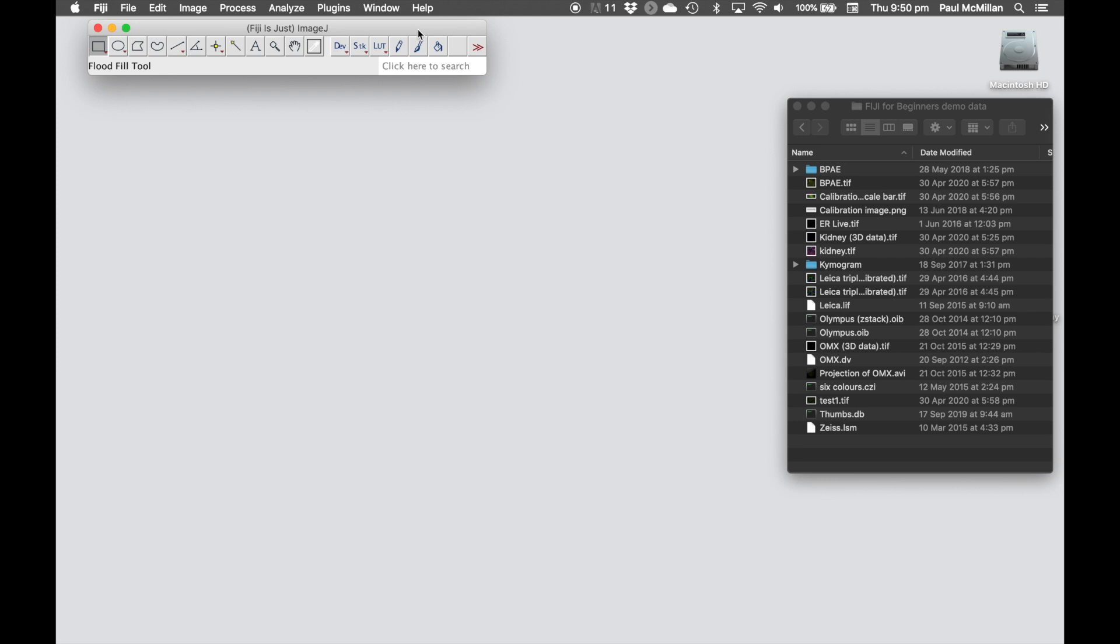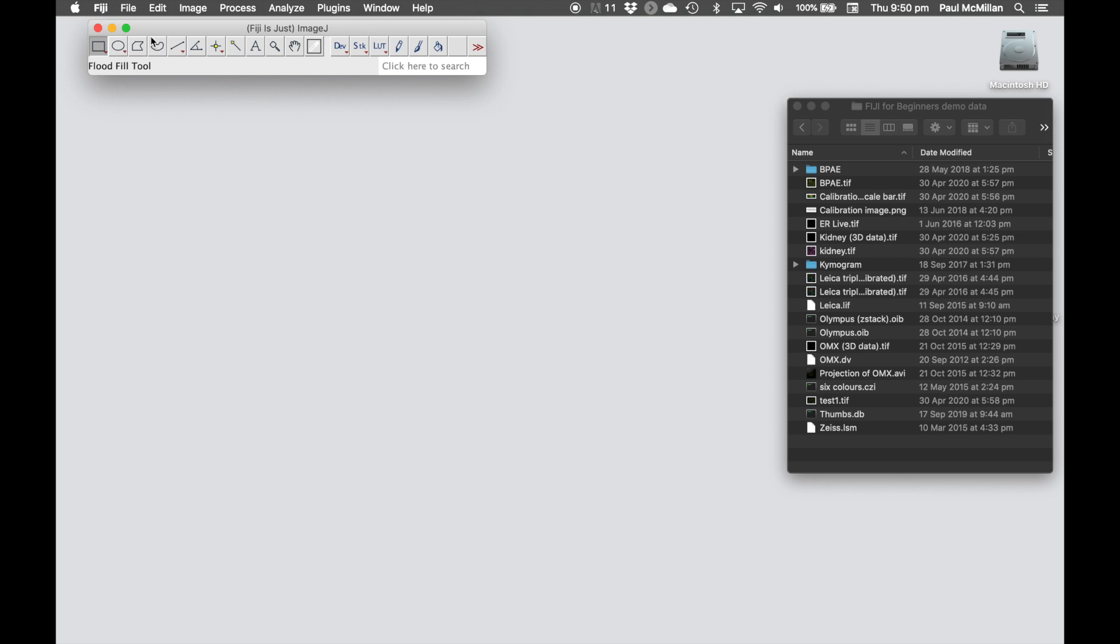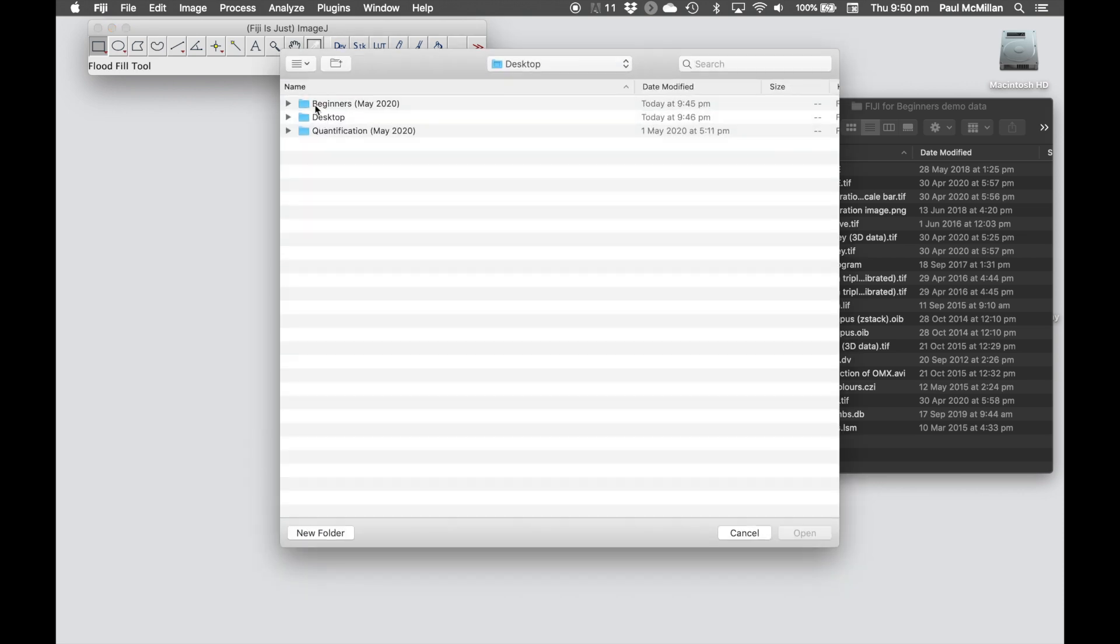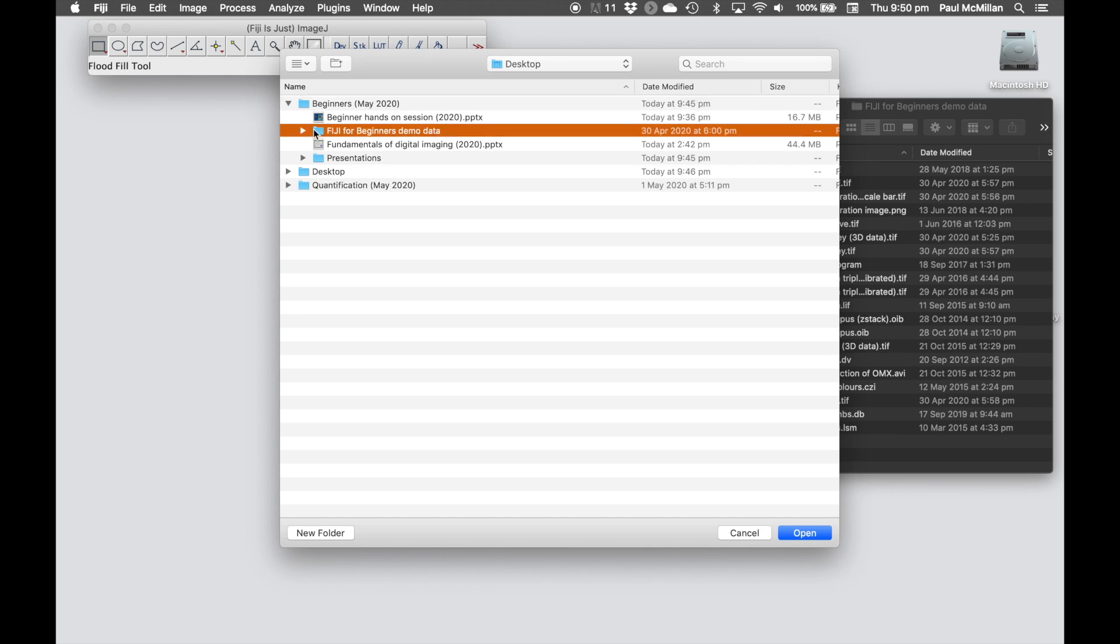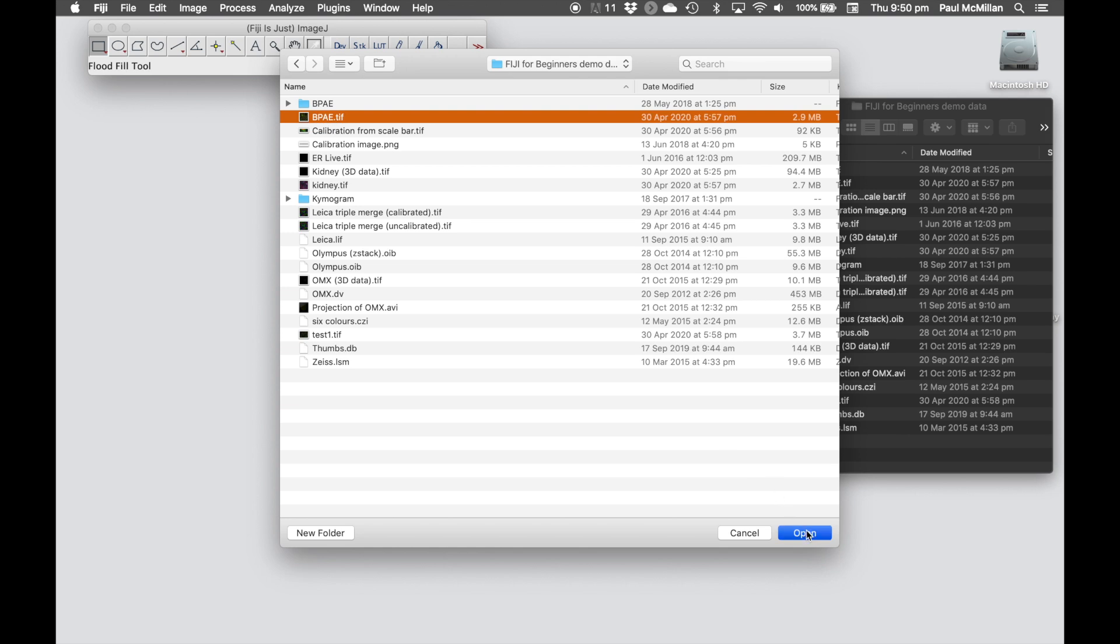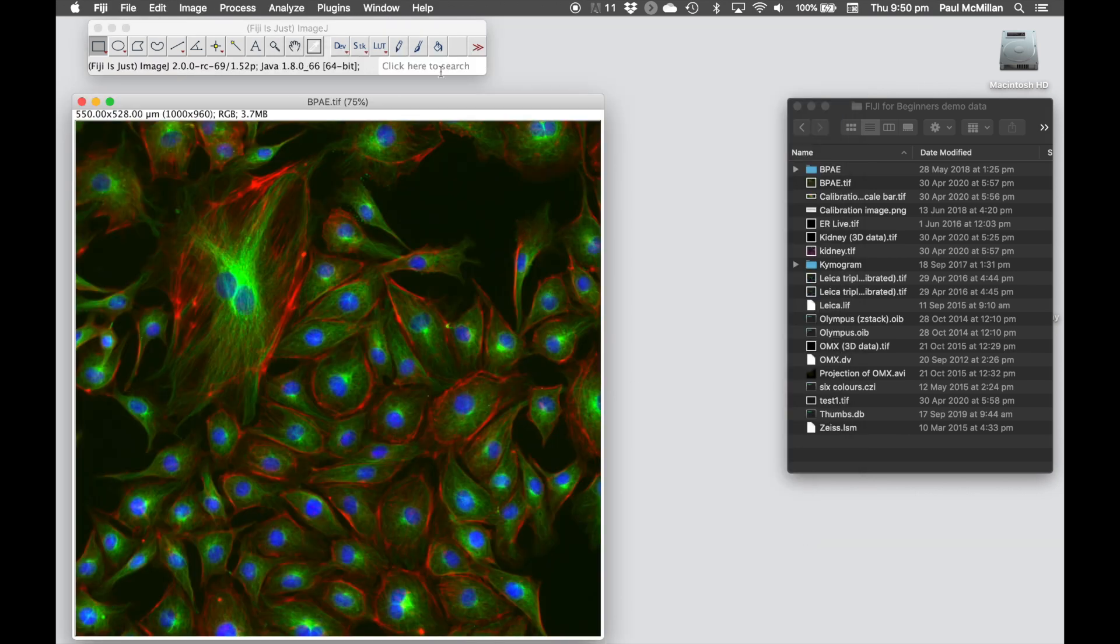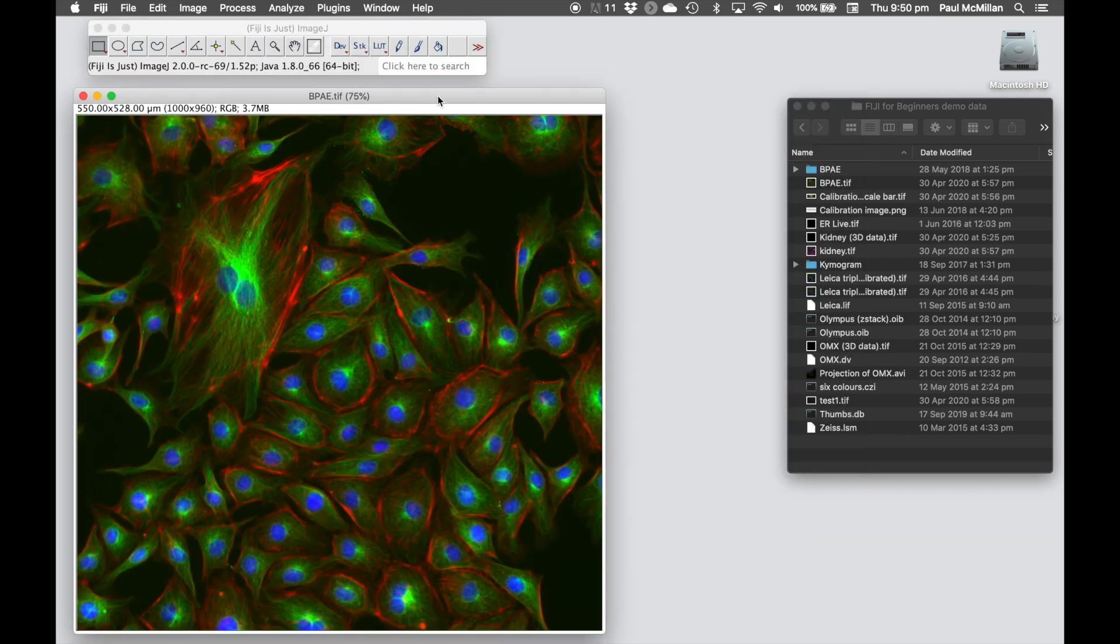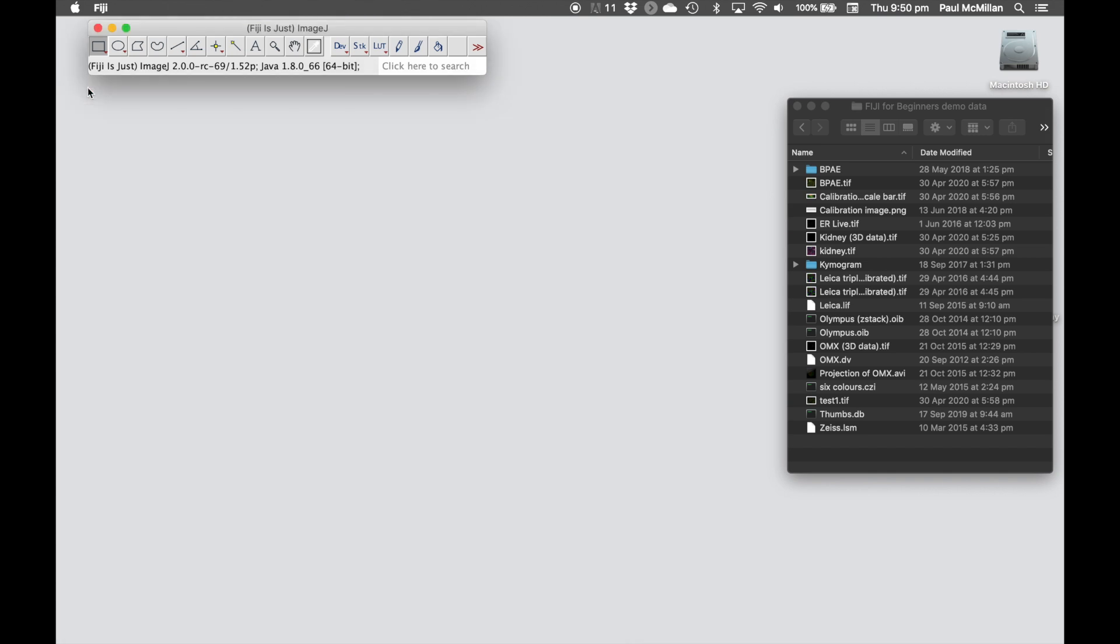There are a number of ways that we can import data into Fiji. First of all, we can go to File > Open. We could go to the Beginners on the desktop demo data and we can find a file in here. For example, this one, and that will open up that file immediately for us.